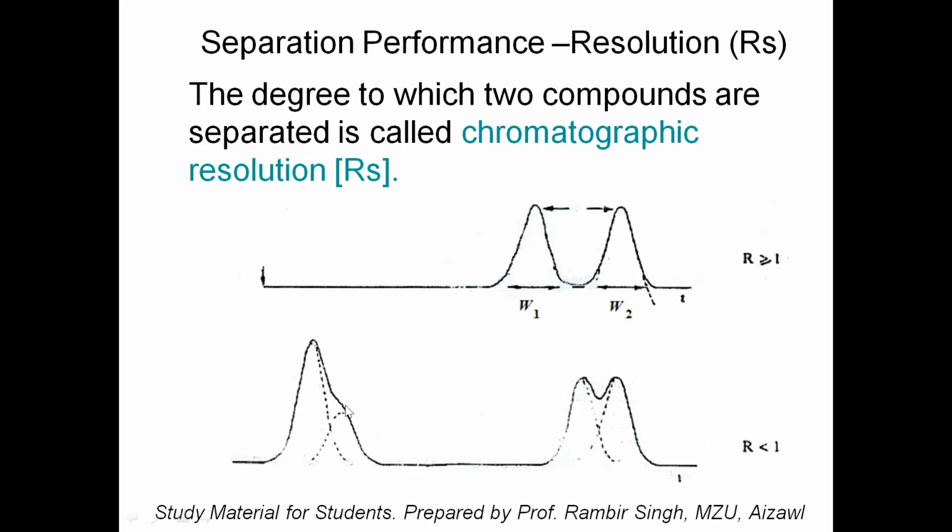You can see there are two compounds, but they are not separated properly. So for separation of these compounds, we have to change our mobile phase, or maybe the stationary phase also. But generally, stationary phases are fixed, because if you are using a reverse phase column, then generally we use a C18 or an ODS column. Every time we cannot buy a column which is costing us say 30, 40 or 50,000 rupees, right? But I can easily change my mobile phase.